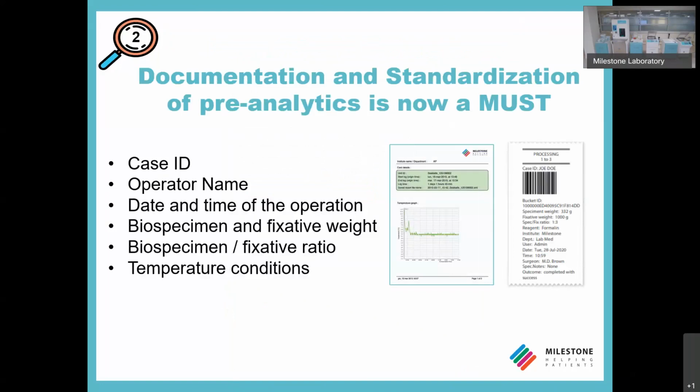So, in simple terms, the documentation and standardization of pre-analytics variables is now a must. We must reduce the variables and make it a more standard procedure. To do that, data collection is fundamental to understand, for pathologists, when a fixation process starts.